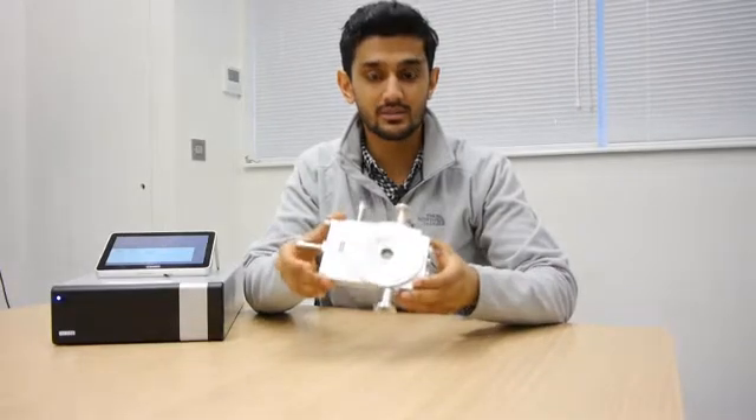Hi, I'm Shrey, and in this video we're going to talk about the FDCS196, which is the stage I've got over here.